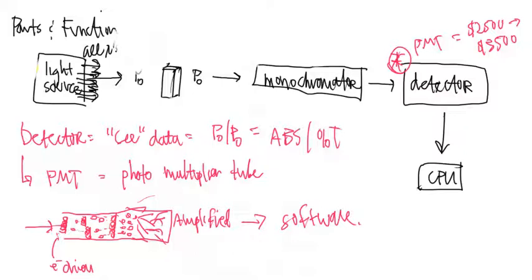So that is what we call the detector. It is a PMT, photomultiplier tube, and it gets a signal from a very weak delivery, and it amplifies that, and it makes it bigger and bigger and bigger until it comes out the other end with a full-blown signal. It kind of exaggerates the signal is what it does. I mean, that's its purpose. All right?